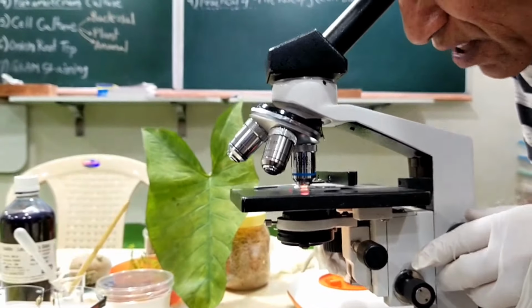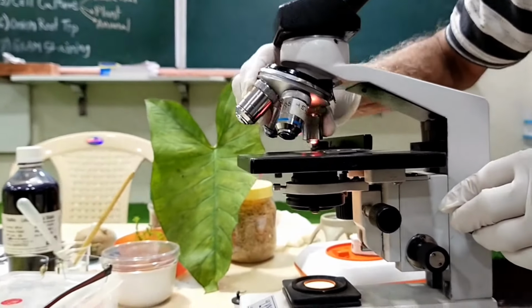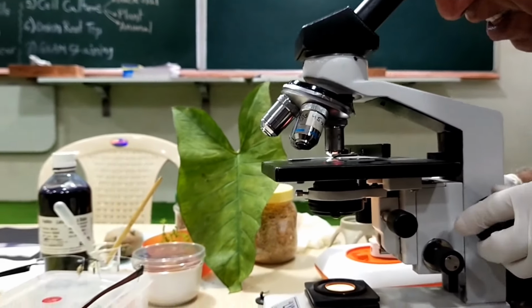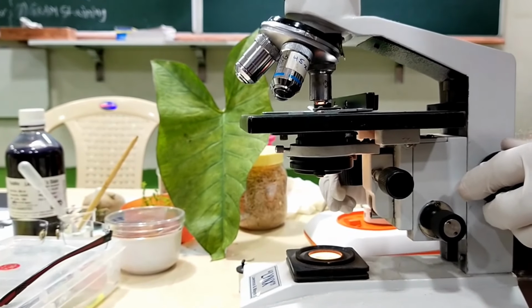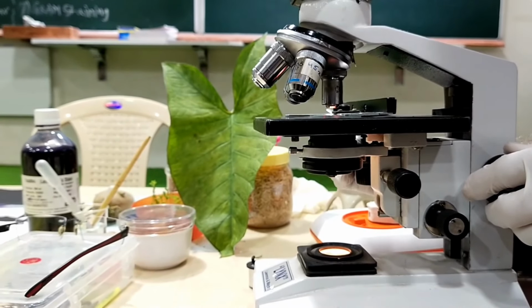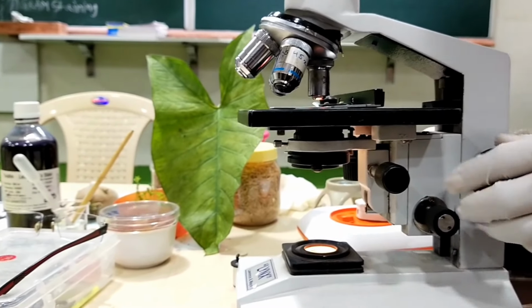Try to select the area, first there should be low power. Select the area which has lesser cells, I mean, less crowding of the cells, where the smear is thin. Usually at the edges the smear is thin. So here it is, smear is thin, and yes, it is possible to adjust.